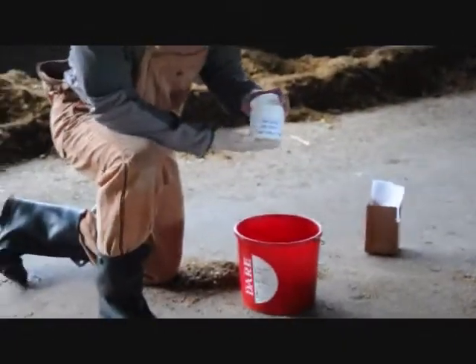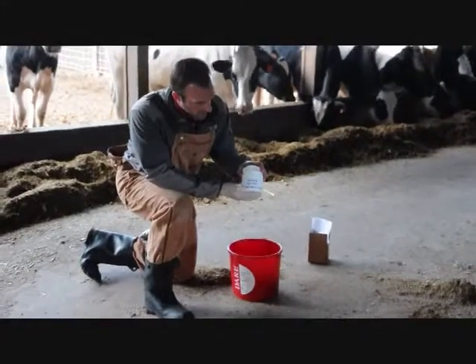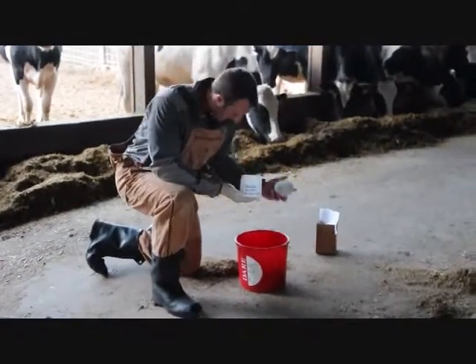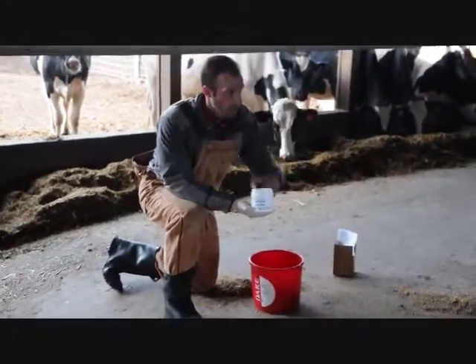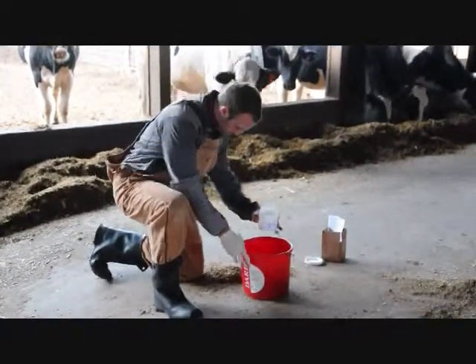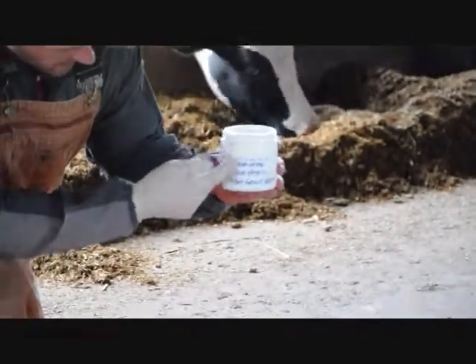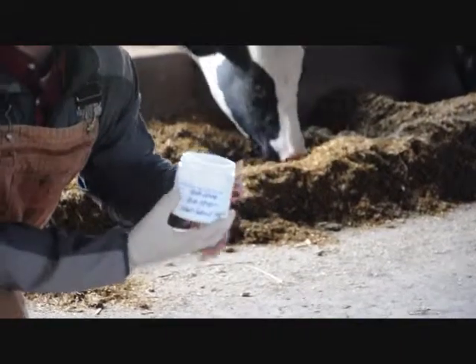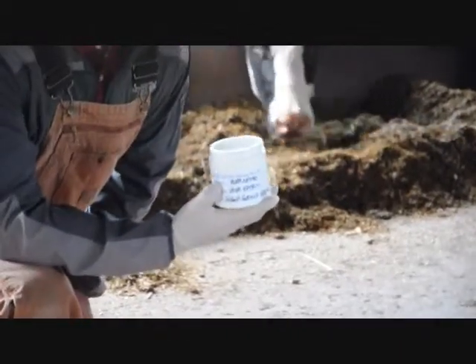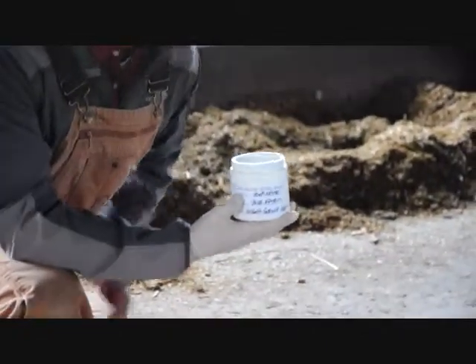For the sampling containers, I like pre-labeling everything so we're not out here writing in cold or unpleasant conditions. I'll have the cap off before I go and get the manure sample. You'll see there's a fill line — we're going to fill up to that line, but we don't want any sample above that line because there's some expansion during transport. We're going to be shipping these via UPS or USPS and we don't want those containers bursting in transit.